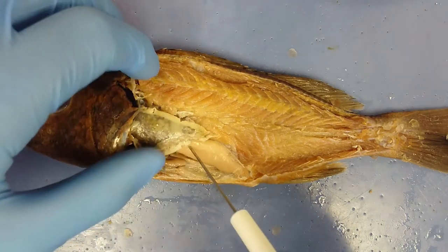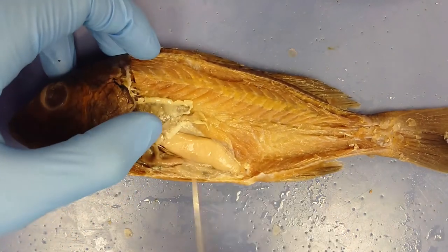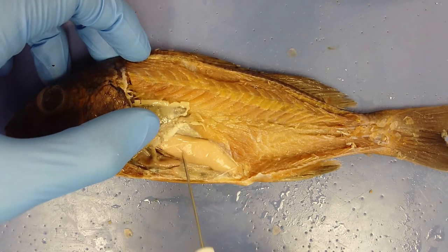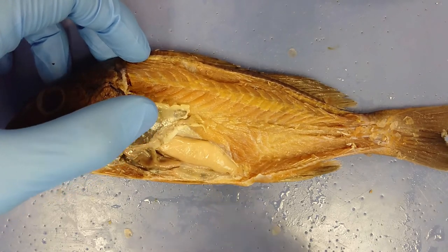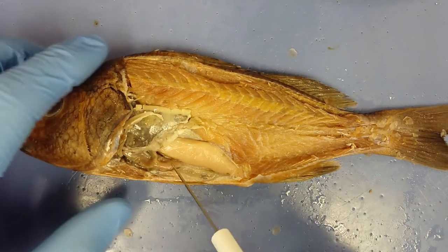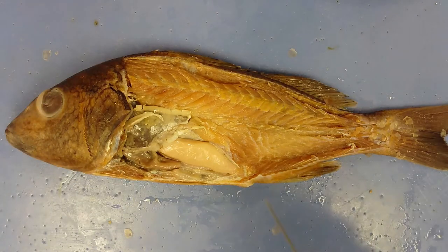Moving the liver in the other direction reveals the gonads. This entire tan mass is the ovaries — this is a female fish producing eggs. This very large organ is supporting the hundreds of thousands of eggs this fish will produce.